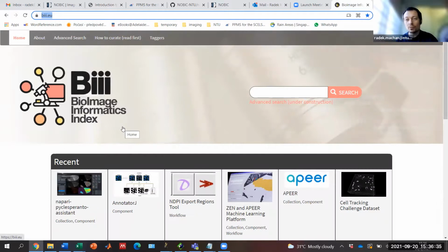It is a website to search different tools for bioimage analysis. It doesn't apply only to Fiji, but there are of course also Fiji plugins listed among the tools. It's not yet fully comprehensive. I looked for some plugins which I know of, and I found some. I didn't find others, but if people keep posting their tools here, if it becomes an established feature for all bioimage analysts who are developing new tools, then it potentially will be a very useful tool which will allow you to search for tools not only in Fiji but also plugins or other programs.